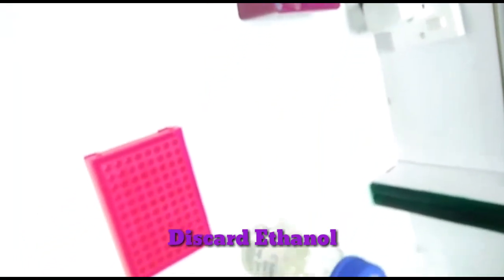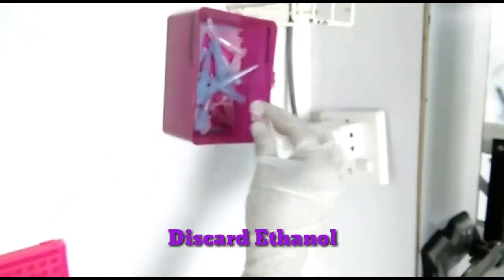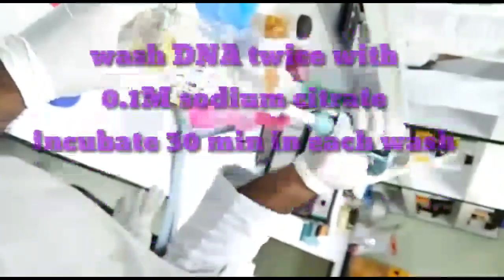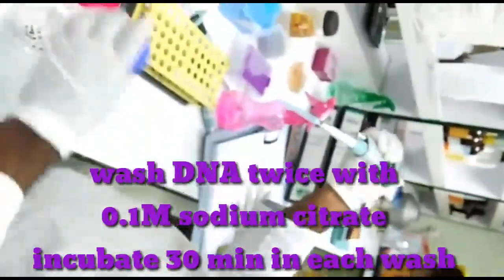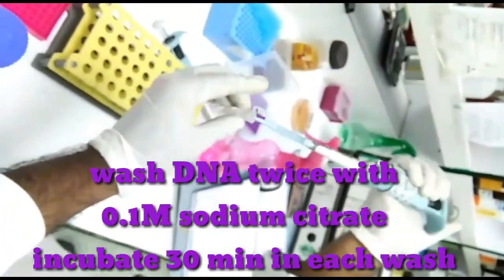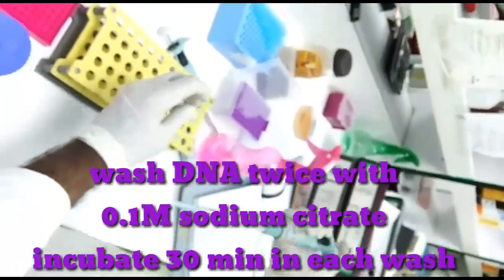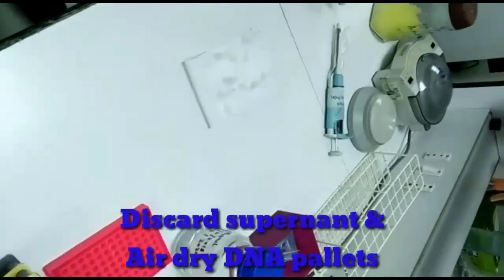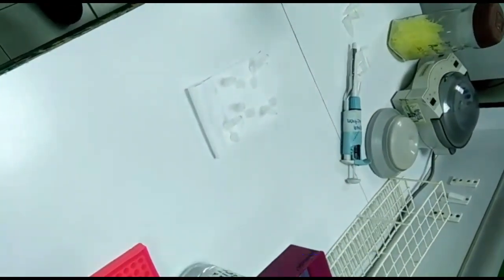After that, discard the ethanol carefully and suspend DNA pellets in sodium citrate solution twice. Sodium citrate solution must be prepared in 10% ethanol. Then remove the sodium citrate solution and air dry DNA pellets.